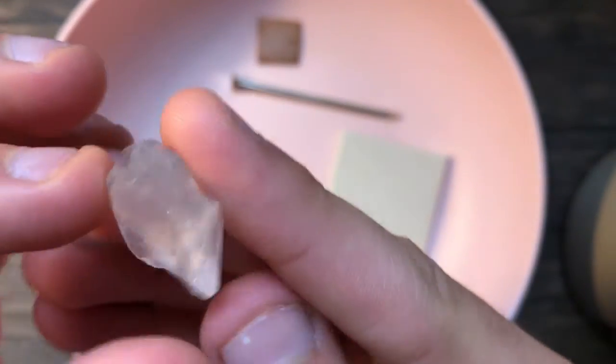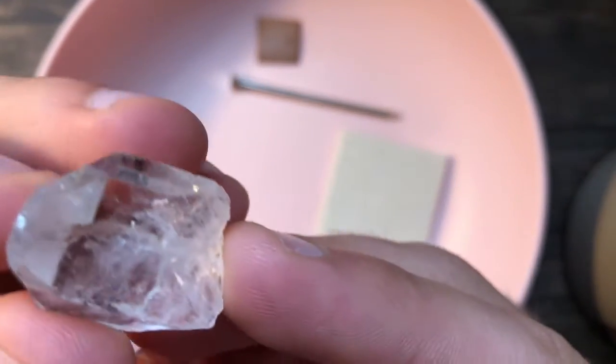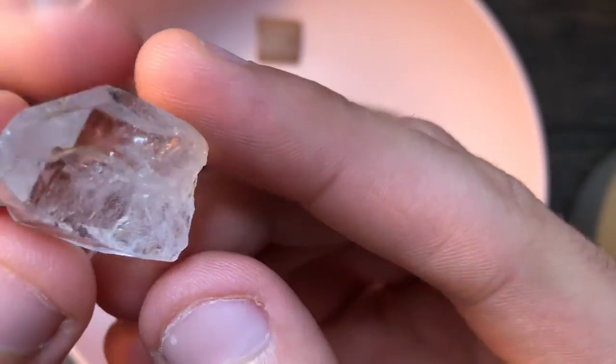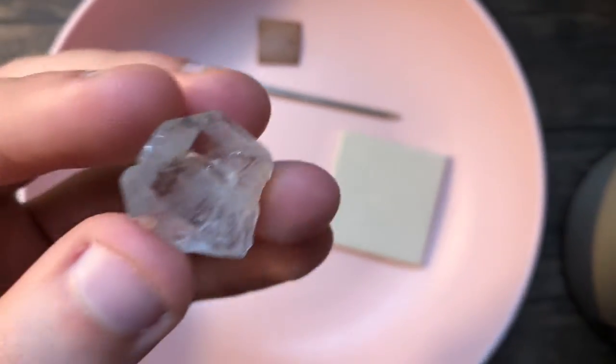And we can start by looking at its color. Very clearly, it is colorless, transparent. Next, we can look at its luster. This mineral has a glassy luster. You can see hopefully from some reflections. There we go. Next, we can look at the hardness of the mineral.